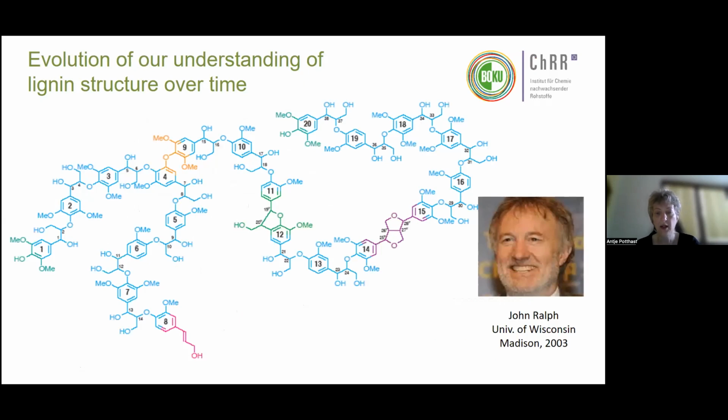And then, of course, we have the native lignin structural models from John Ralph. What is different here is that, for the first time, the structural elements you see here are all confirmed in connectivity by NMR. So that piece is not just a model, this is real. It doesn't show us how the whole lignin is, but it gives us quite a good idea.